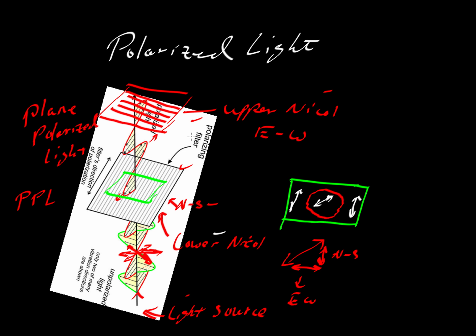When we have two Nicols or two polarizing filters in place, then we call the system crossed polars, or sometimes we could just abbreviate it as XPL for cross polarization. That means we've taken two polarizing filters and put them at crosswise orientations relative to one another. They would ordinarily block all the light if there was nothing here. You take this green material here, which we could barely see, pull it off the stage, all the light would be blocked.